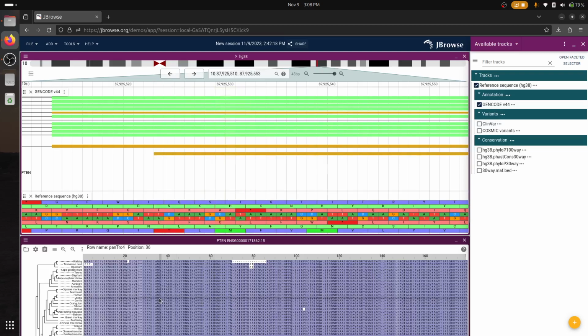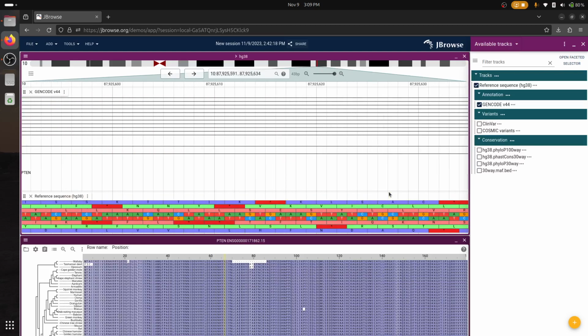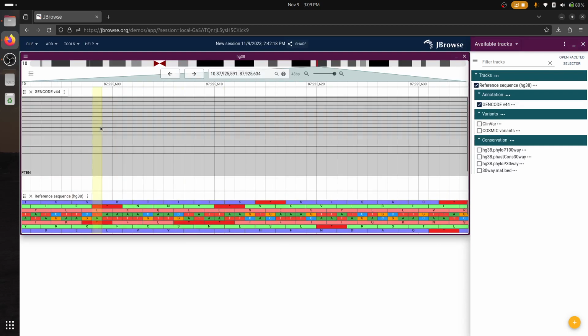And we can also do the same thing going the other direction, where if I'm highlighting over the L, D, S, K, H, so it has this sort of bidirectional quality. And that's very useful for connecting your data in the genome space to the protein space and vice versa. And this works for both positive and negative strand genes. And it's been a work in progress doing all those coordinate transforms.